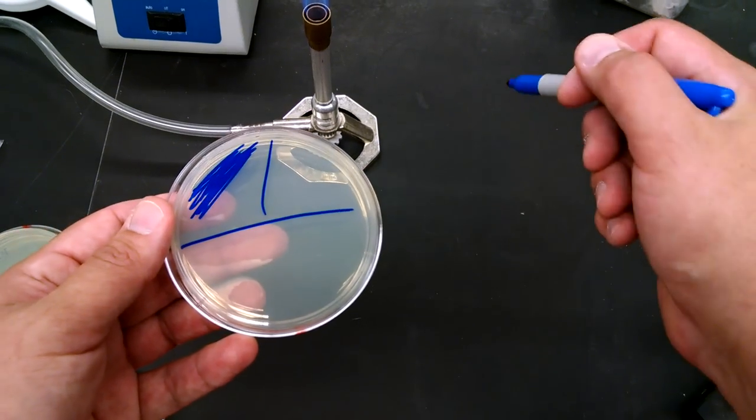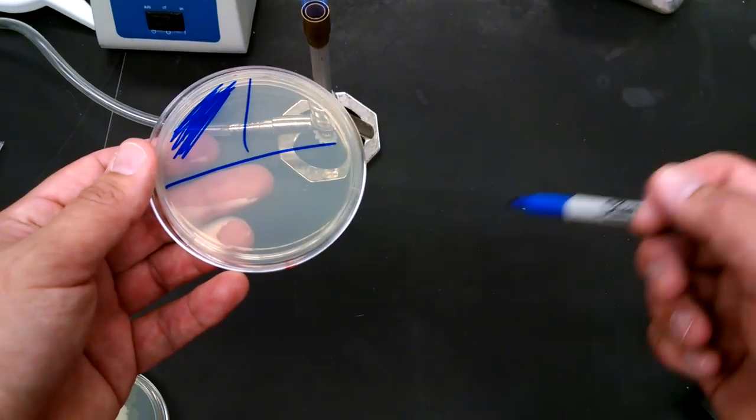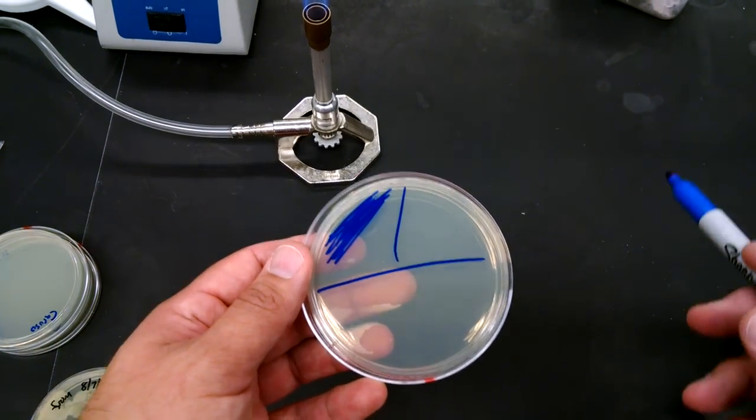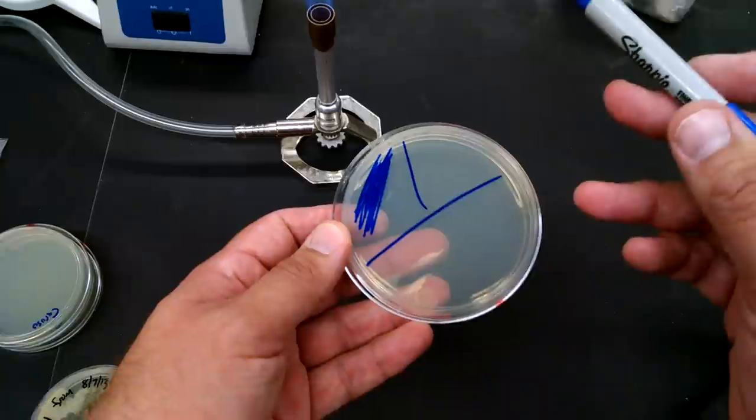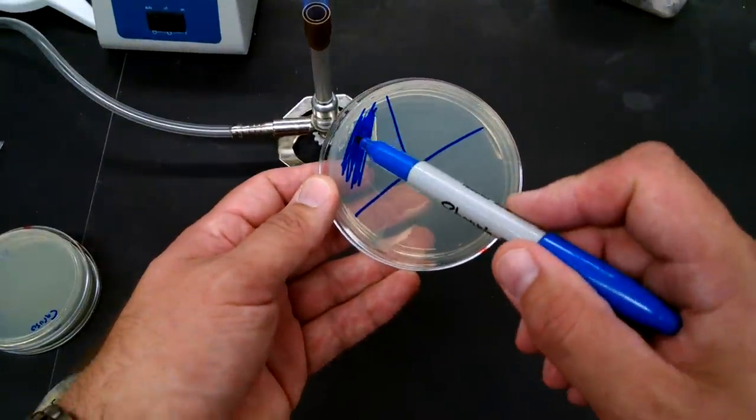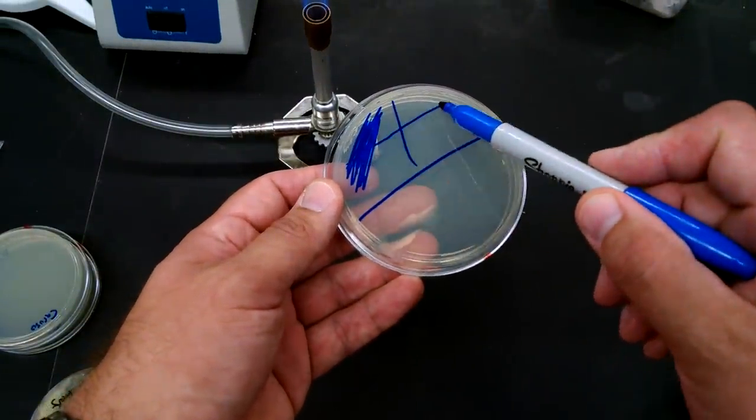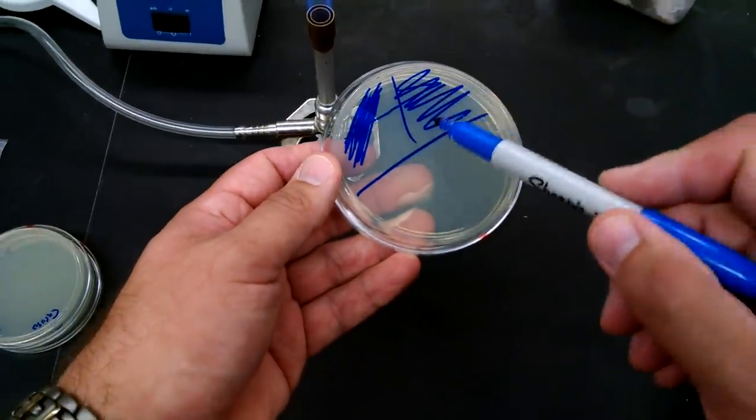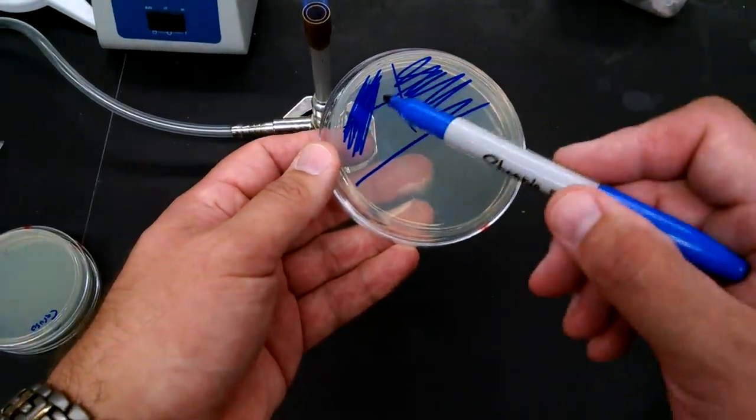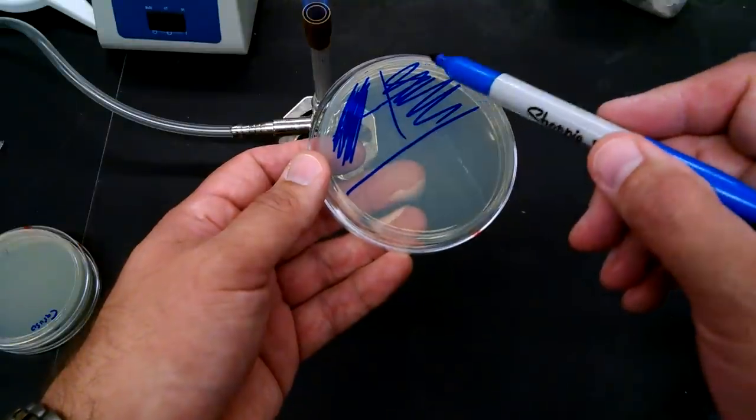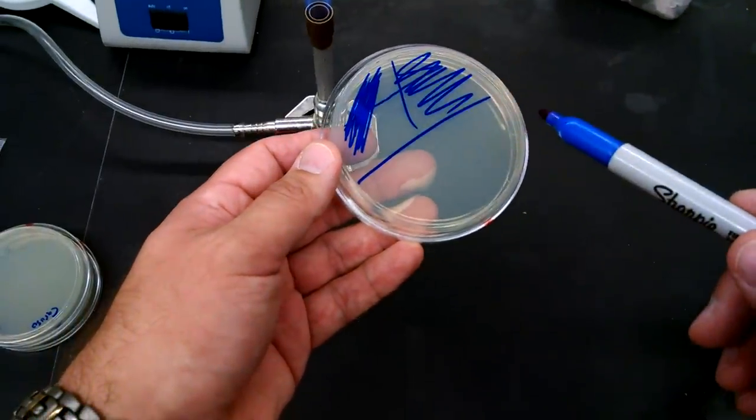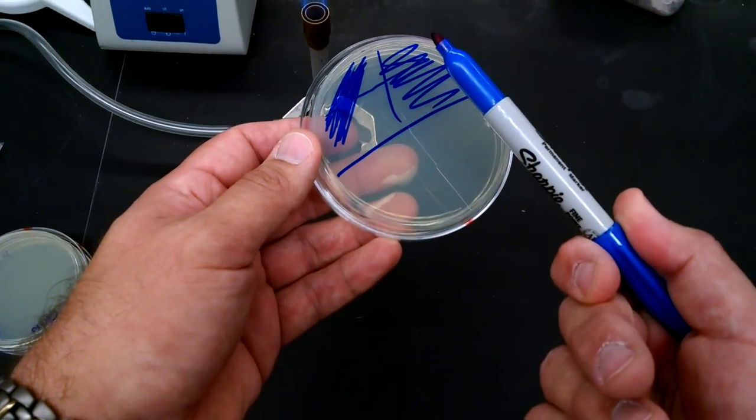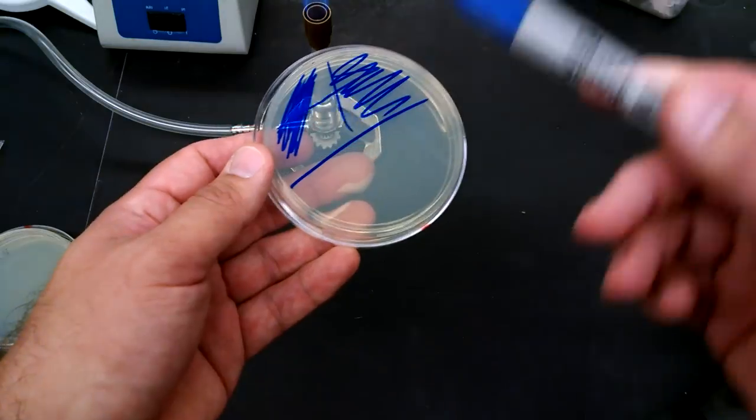Then you're going to either reflame your loop if it's a metal loop, or toss that now contaminated loop away and grab a new one. You're then going to take this new loop and drag it through the sample and then spread that little bit that you took from here into that new region. And so what you've done is you've just diluted a little bit of this and spread it out. That's a dilution, right? You can either flip the loop over and use the clean side of it or toss it and get a new one.